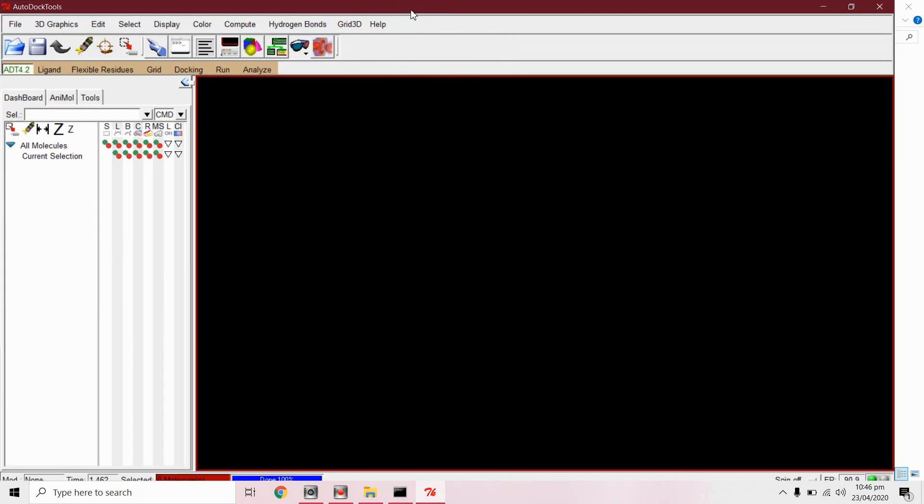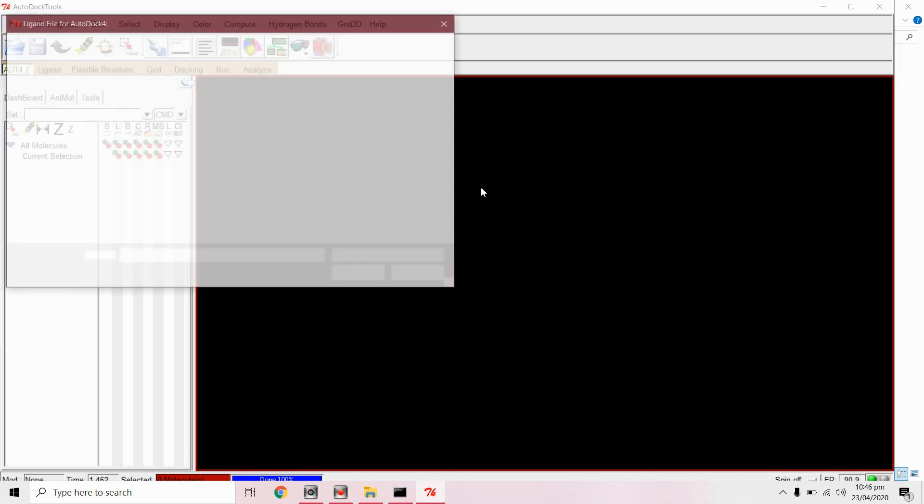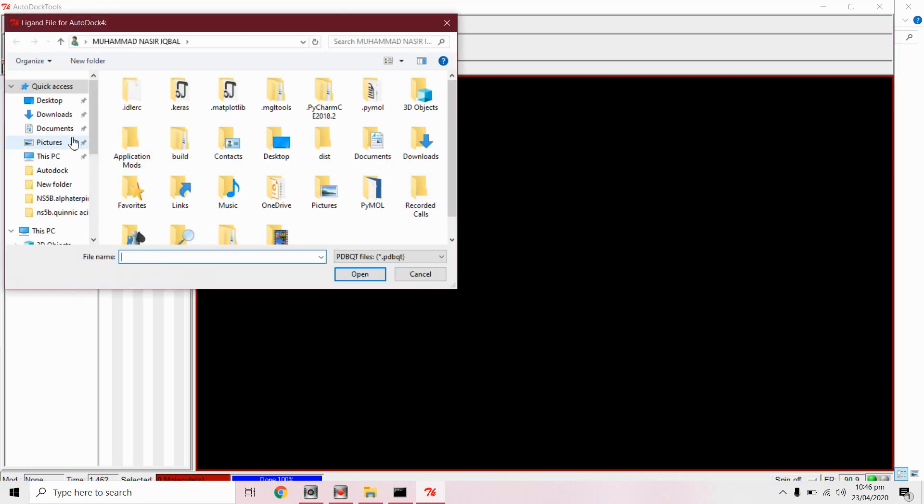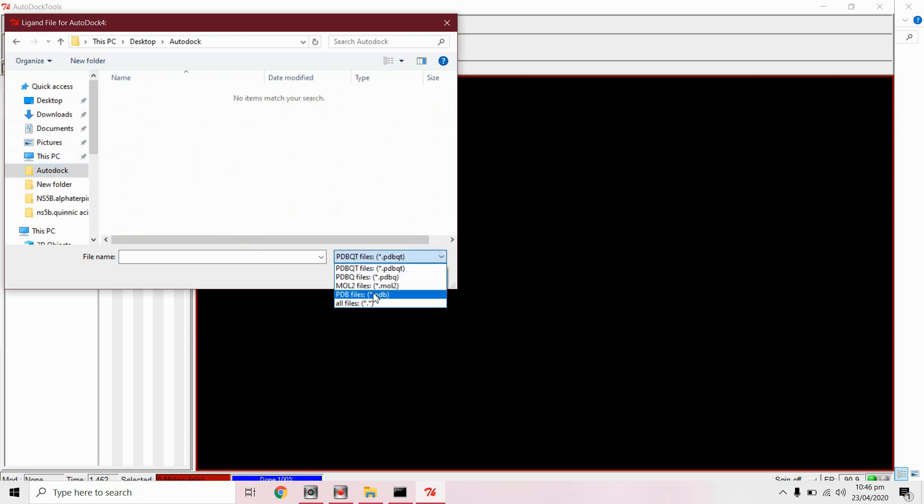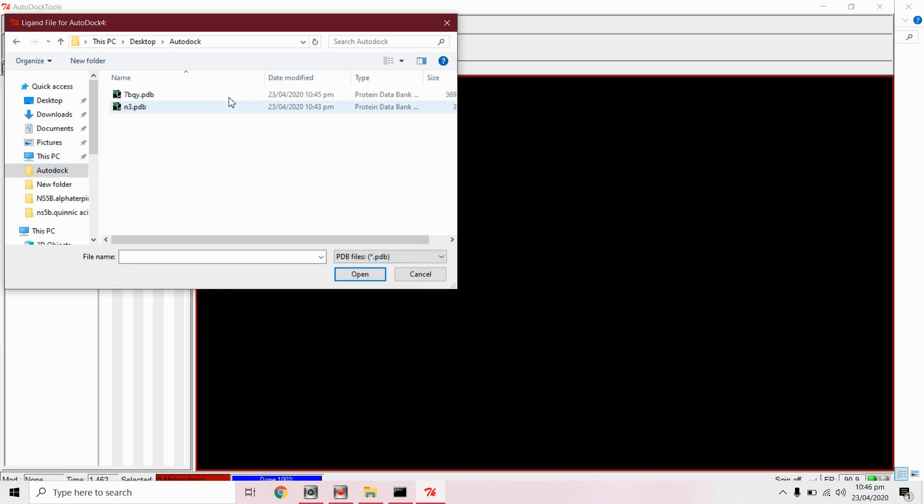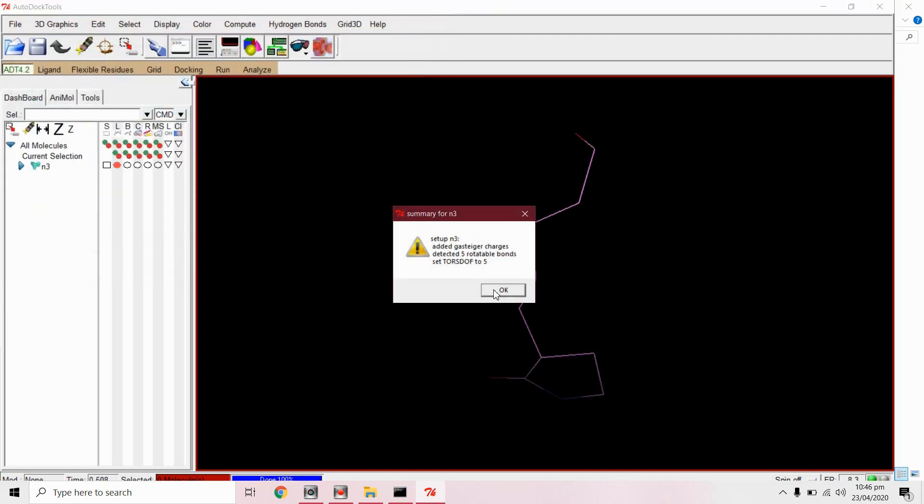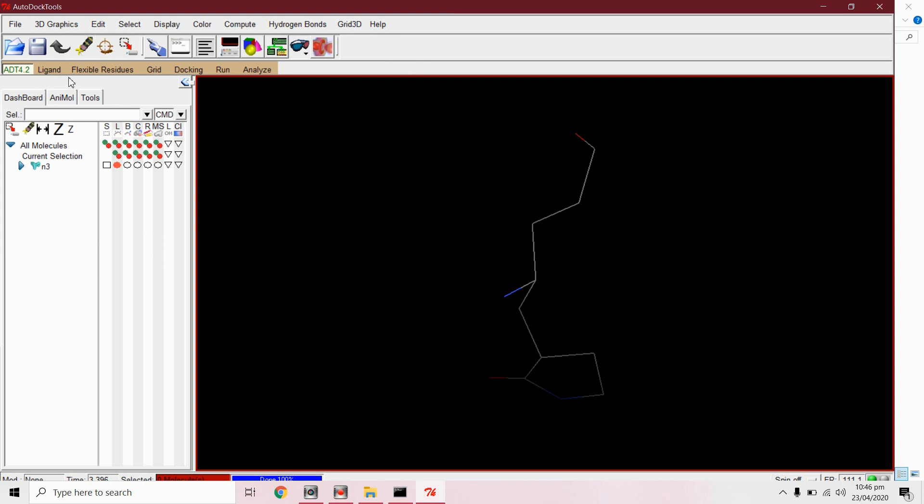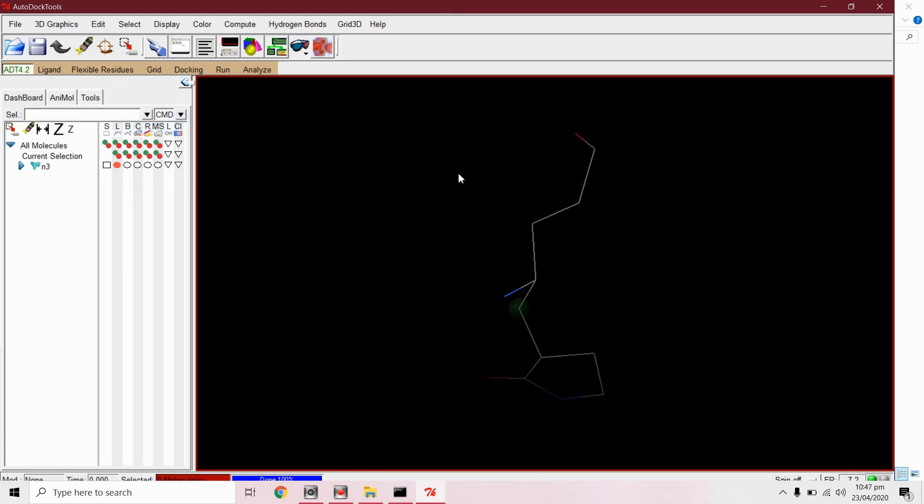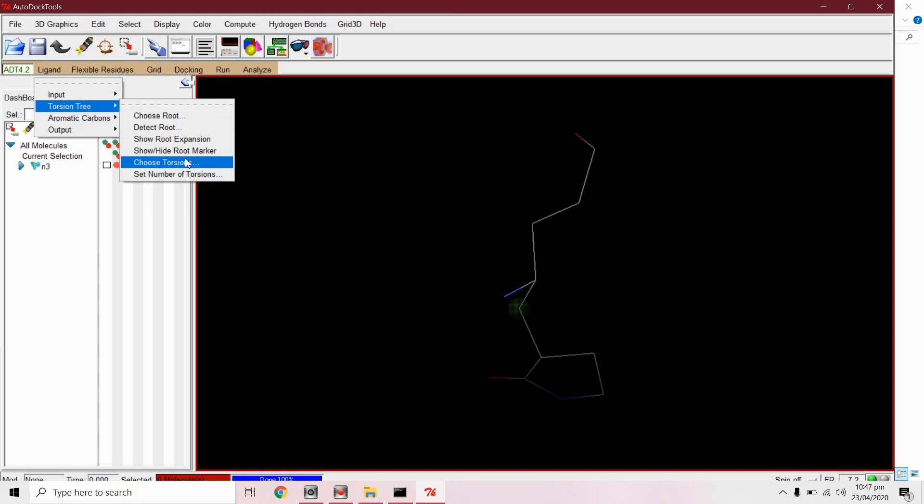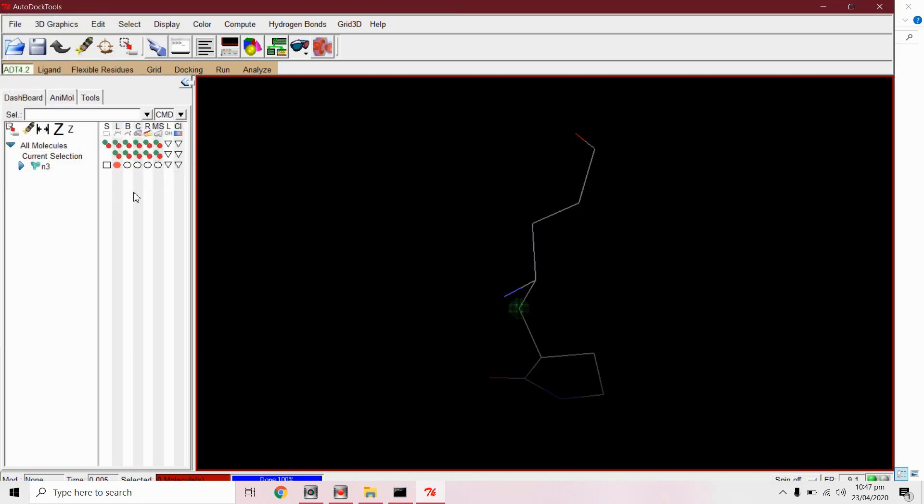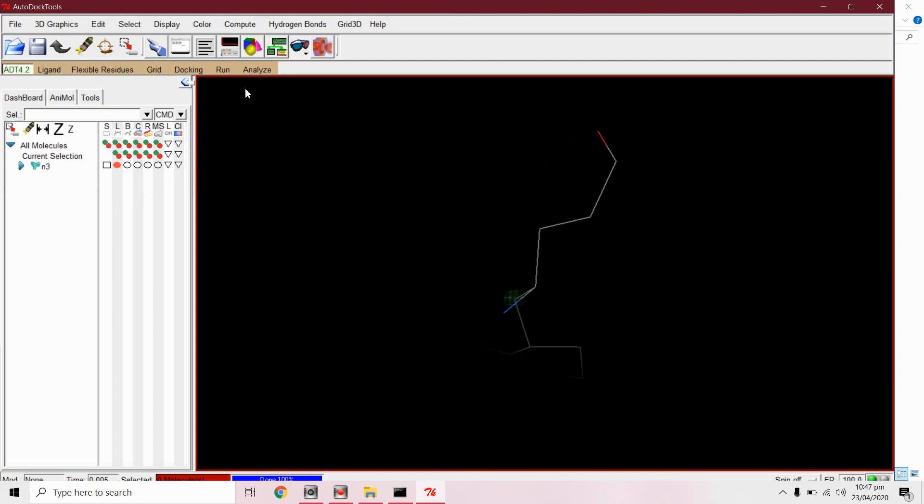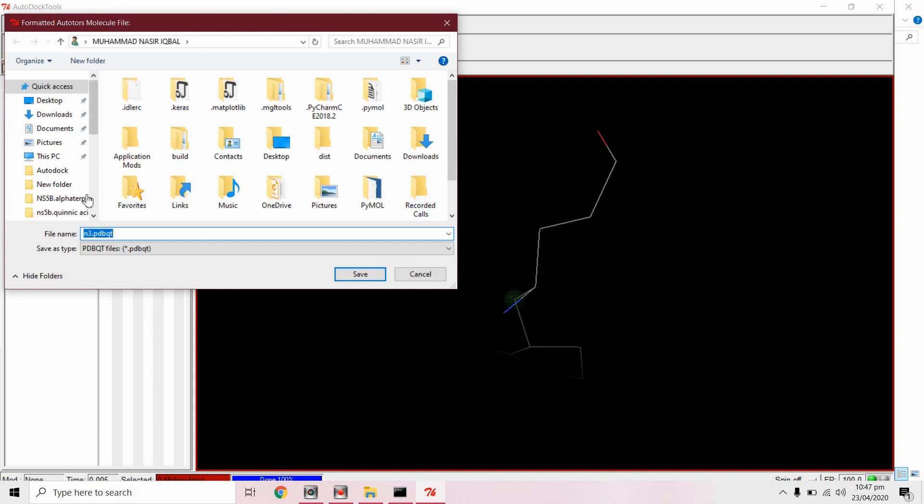First from ligand input open. Now from ligand torsion tree detect root. Now from ligand torsion tree choose torsion, done. Now we will save this in dot PDBQT format from ligand output save as PDBQT.